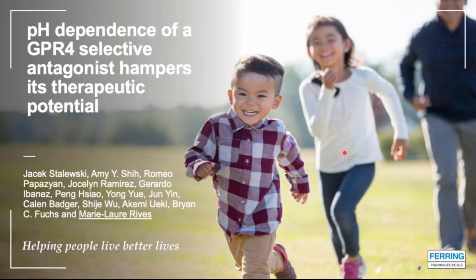Hi, good morning. My name is Marie-Laure Rives, and today I'm going to present some work that was performed at Ferring Pharmaceuticals. I'm going to talk about the pH dependence of the GPR4 antagonist that we believe impairs its therapeutic potential, and also highlight how SPR microscopy has helped us characterize its mechanism of action.